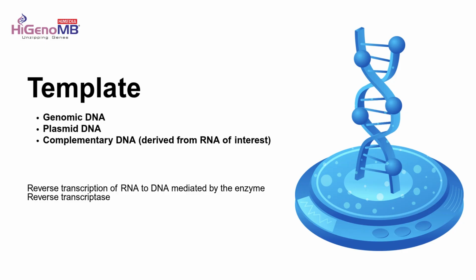To make it a bit sturdier molecule, a technique called reverse transcription is used, where the RNA is reverse transcribed by an enzyme called reverse transcriptase into DNA. Hence it is called complementary DNA. So we can conduct PCR with any of these three templates.